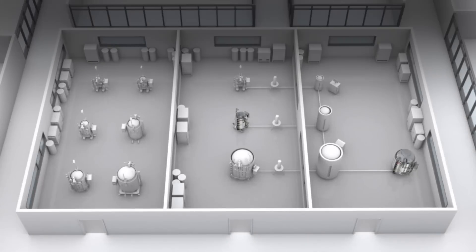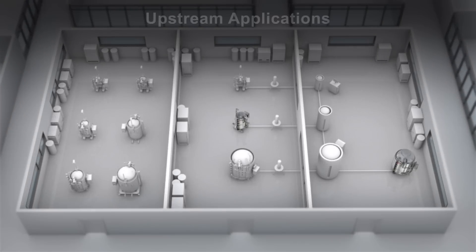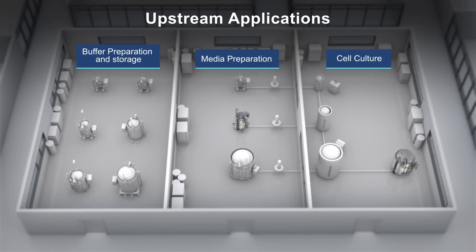The next-generation Thermo Scientific Hyperforma SUM is ideal for liquid-to-liquid and powder-to-liquid mixing in critical upstream workflow applications, including buffer preparation and storage, media preparation, and harvest vessels.